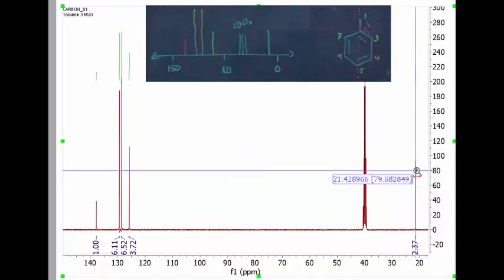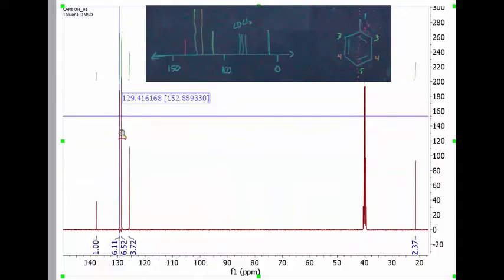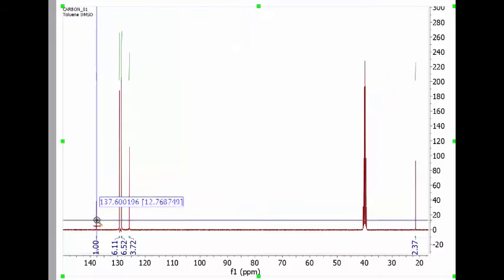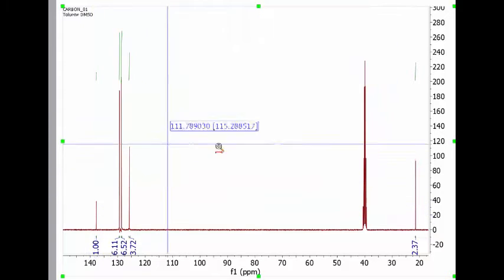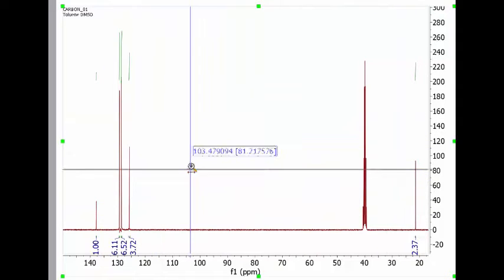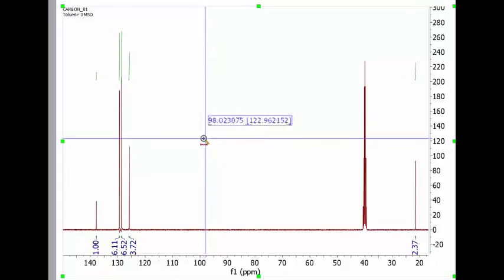and if you're looking at intensity, you would conclude that these two are the same height, and these two are quite a bit taller, and then to my eyes, this is pretty clearly a quaternary, but it also could be the case that this is 1, these are twice as tall as that one, and these are twice as tall as that. So you're going to always have to do some interpreting.